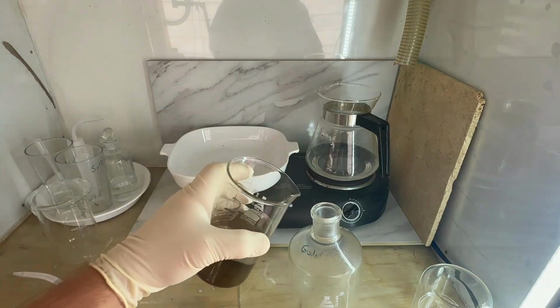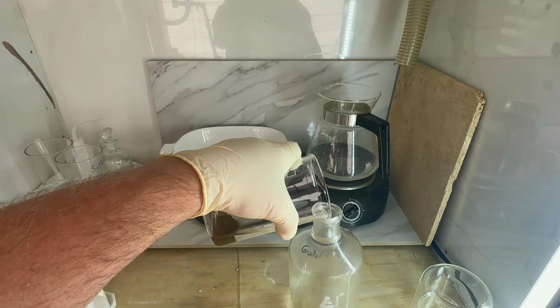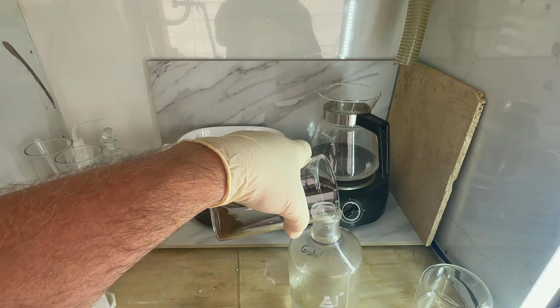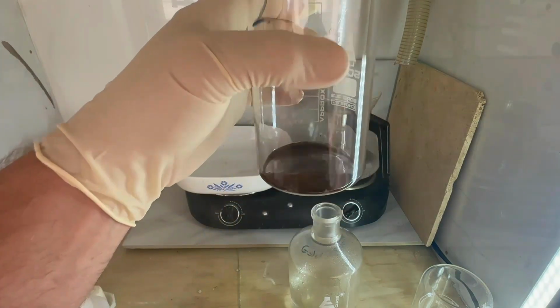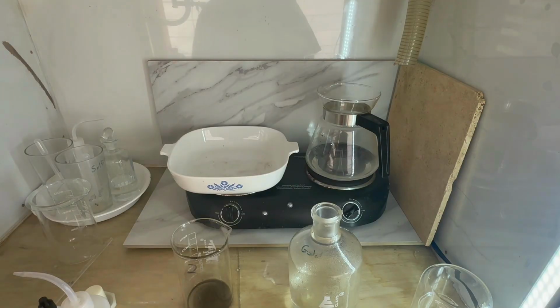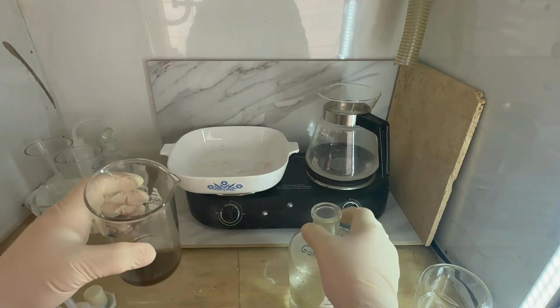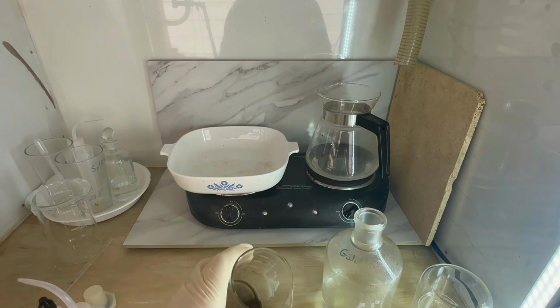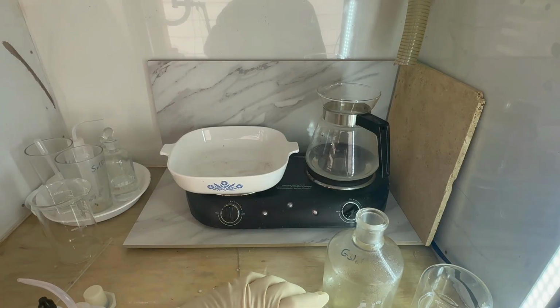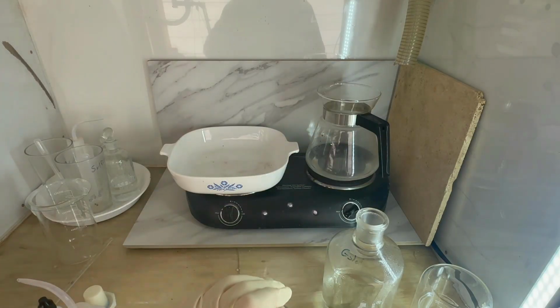Let's decant this off. All right, going to try to rinse this with some distilled water. See if it'll settle down. Give it a couple of seconds. Then we'll decant off the distilled water. That's pretty fine. I can see it coming. It's pretty fine gold. You can see that we're losing a fair amount of gold into the beaker.